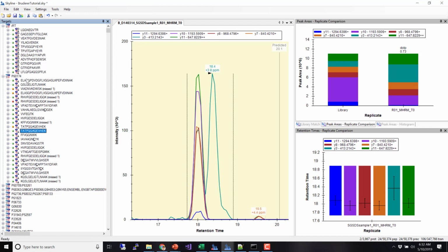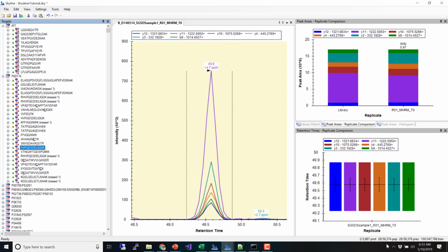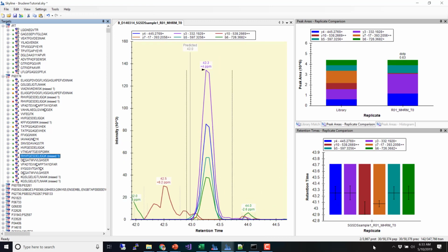Yeah, so if we really wanted to do quantification on these, this is where the idea of refinement comes in. There's no way we're going to go through all of these because there's 58,000 peptides here. But you can already see that if we quantify this protein by all of the peptides, probably that will do okay.